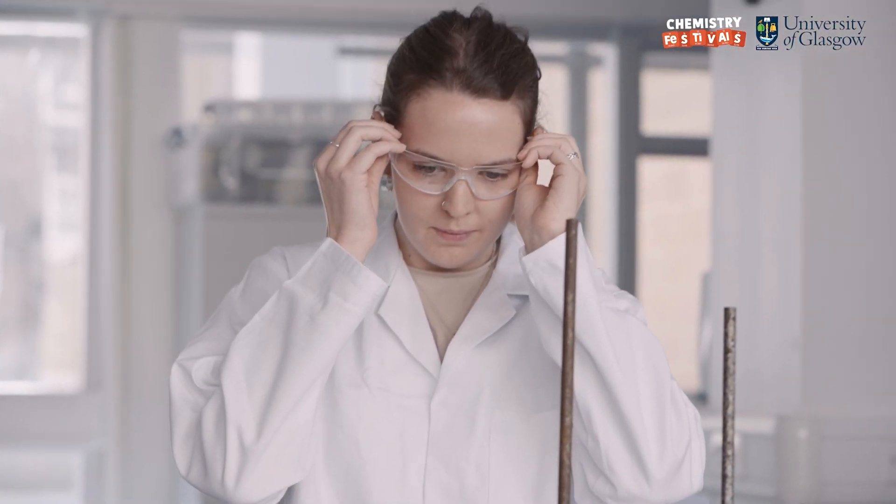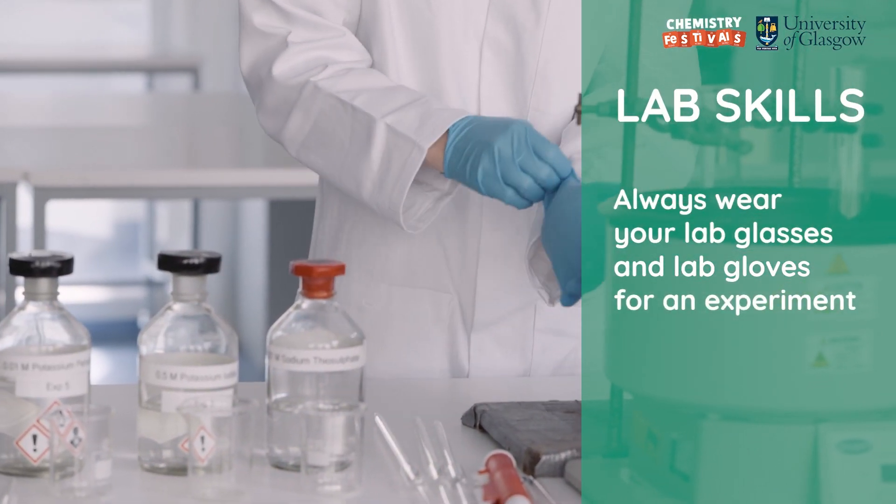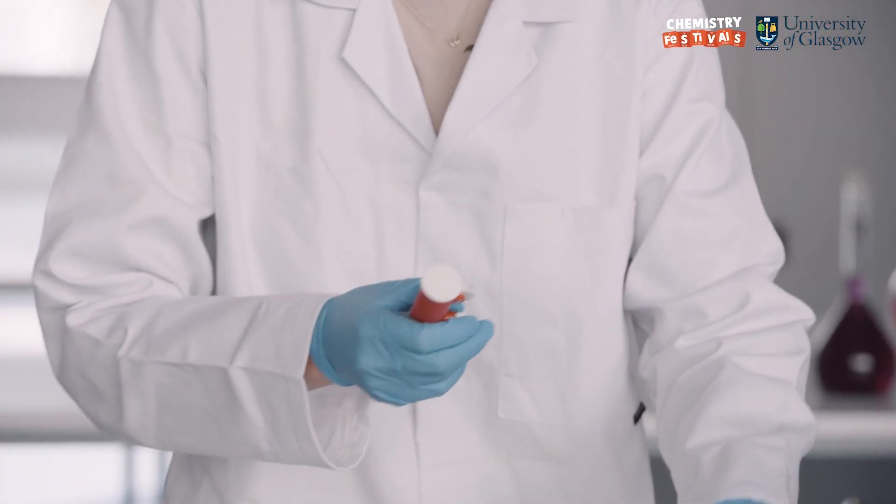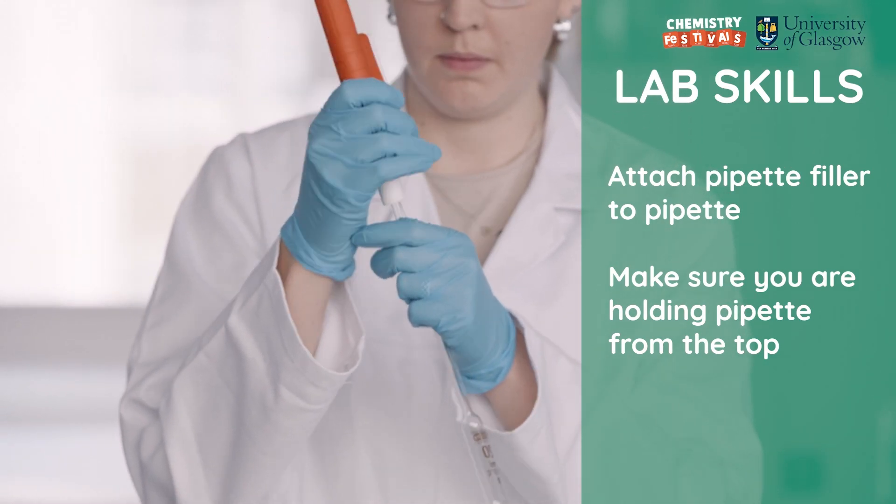I will now show you how to wash and fill a pipette. First I'm going to put my lab glasses and my lab gloves on. We're going to be using a 20 ml pipette. I'll attach the pipette filler to the pipette making sure to hold it at the very top.